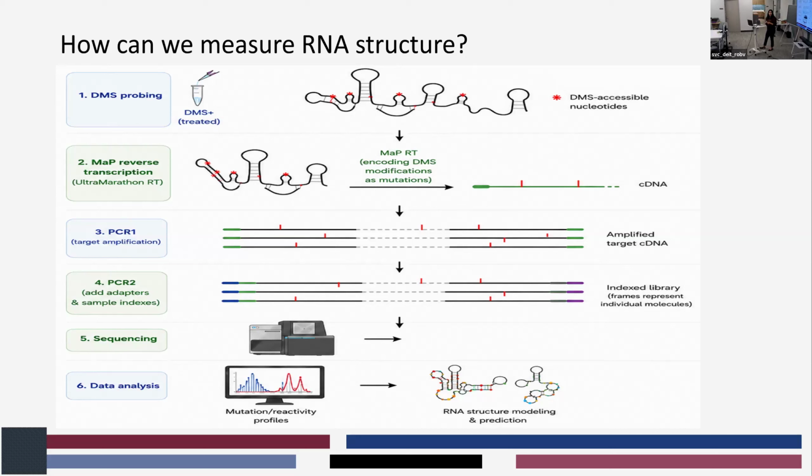The next step is to find these DMS-modified nucleotides. We copy the RNA into complementary DNA. We do the reverse transcription.